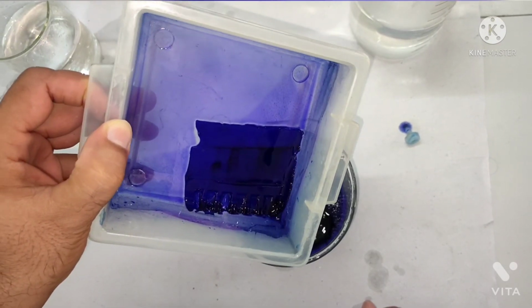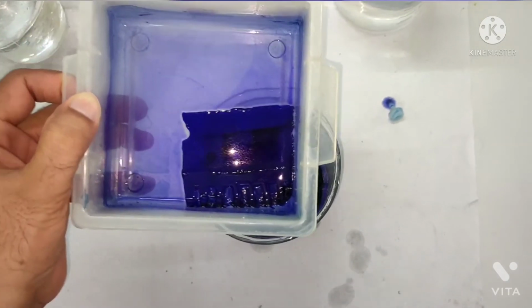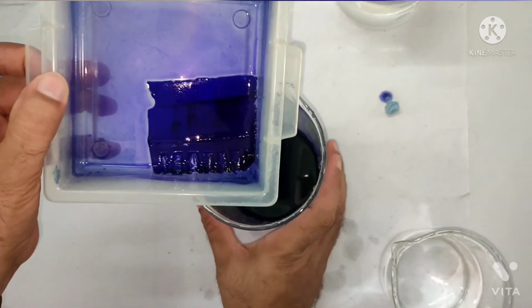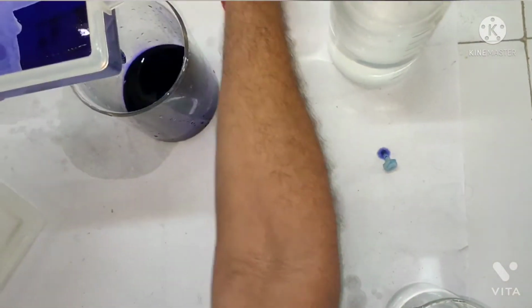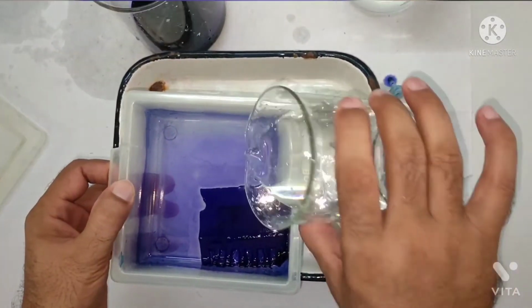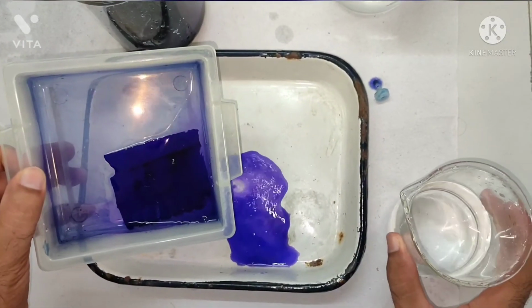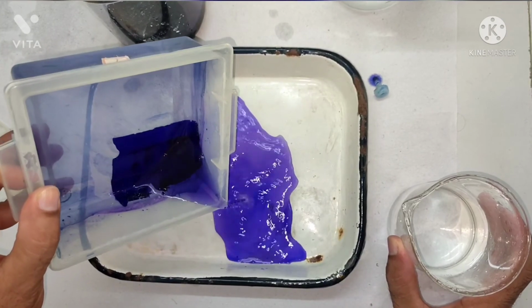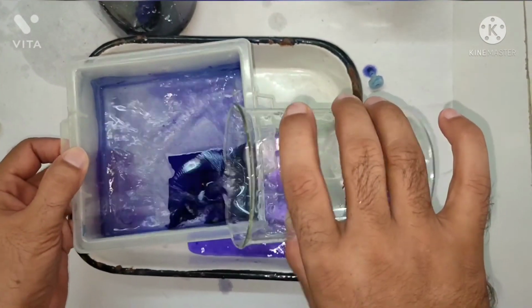And see, even in the presence of staining solution, if your protein concentration is too high, very high, in that case you can see the bands, right? And this staining solution can be used at least 3-4 times. So don't discard the staining solution, right? Staining as well as destaining, these solutions can be reused.